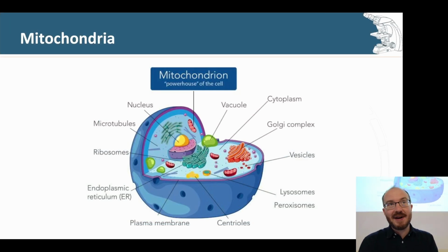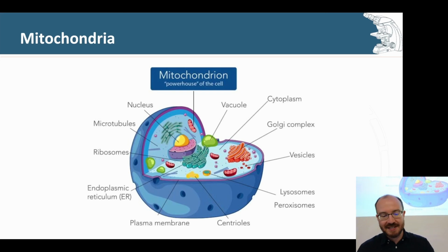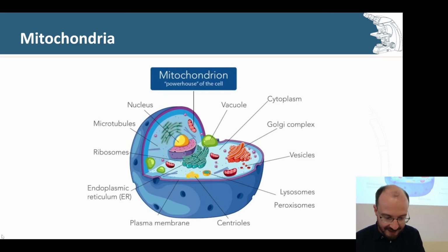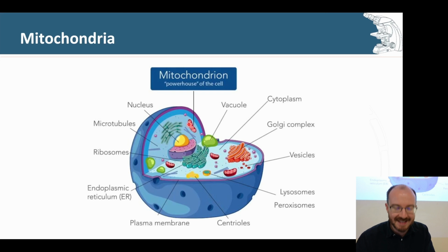This is my own joke that I like to present to peers, because I am not a biologist, I'm an engineer. So from an engineer's perspective, in general, the most that you know about a cell is that, oh, this is what it looks like, because that's what you see in your textbook. And then it's like, okay, great. Mitochondria, where is the mitochondria? There are 4 of them in a cell, okay. They are big blobs that are very easily identifiable.